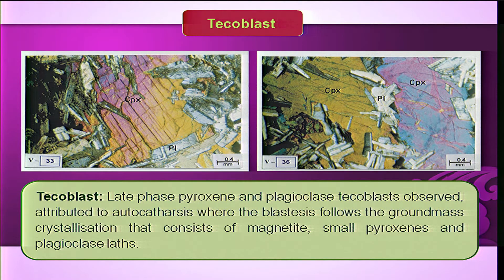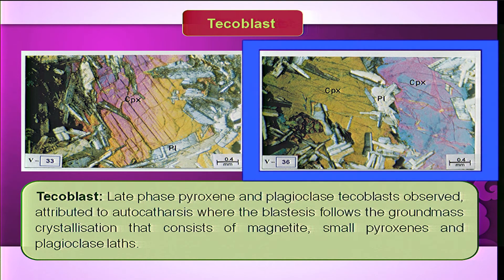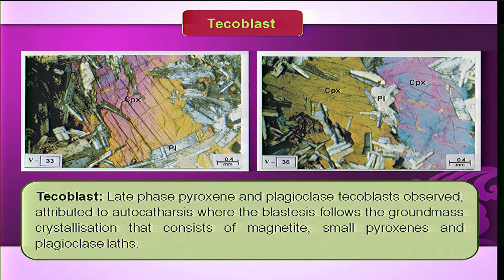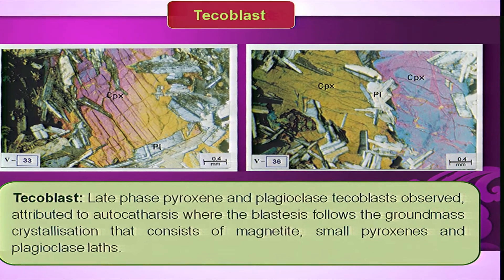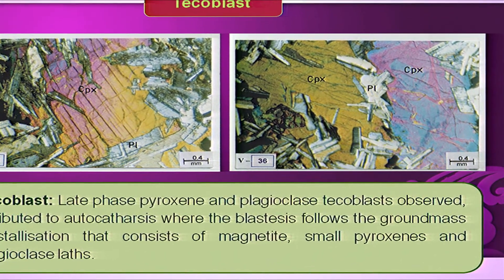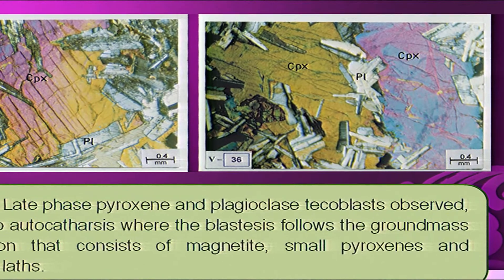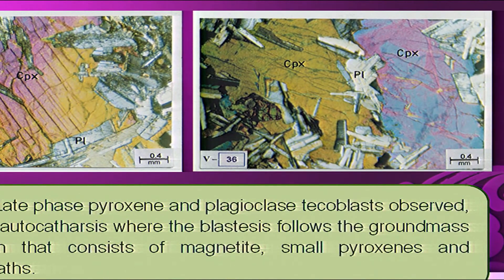See here the clinopyroxene — this is a large-size crystal, and we call it an oikocryst. This oikocryst encloses smaller-size crystals of plagioclase. In another section, large-size clinopyroxene covers the entire field of view, and inside that crystal you have plagioclase — a calcic silicate mineral.